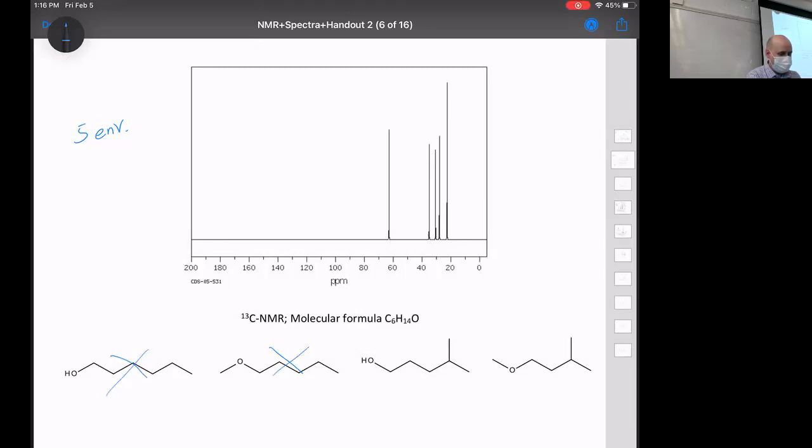And then the first peak to the left is C attached to O. Correct. So she said the first peak on the left is a C single bond O. That's a carbon there. And then I guess the other ones are this out. Yep. So the rest of these you've got are just kind of alkane.